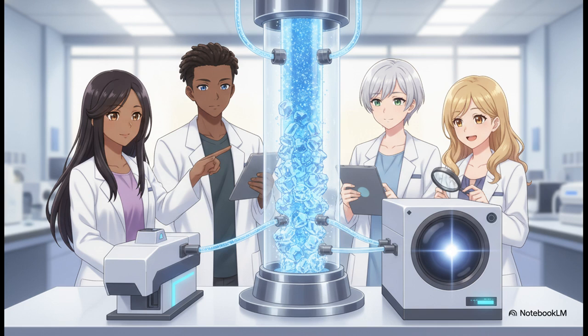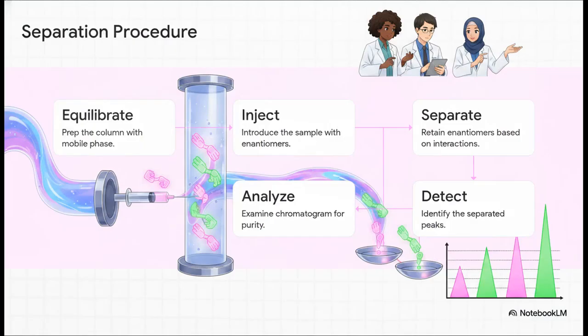Think UV, mass specs, or advanced laser polarimeters to measure that optical rotation. The workflow itself is highly structured. First up, we equilibrate the system with our mobile phase. Next, we inject the racemic sample.